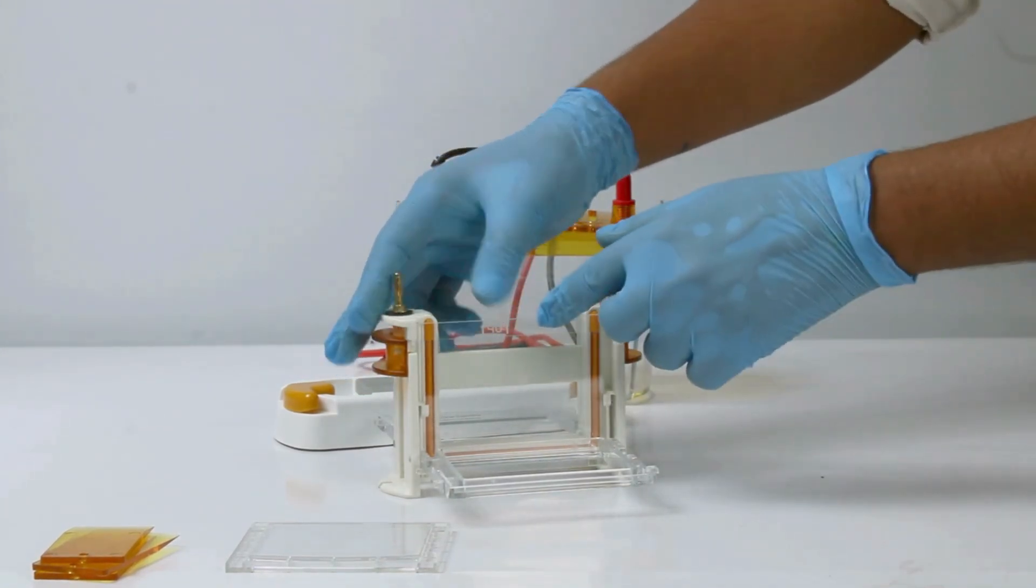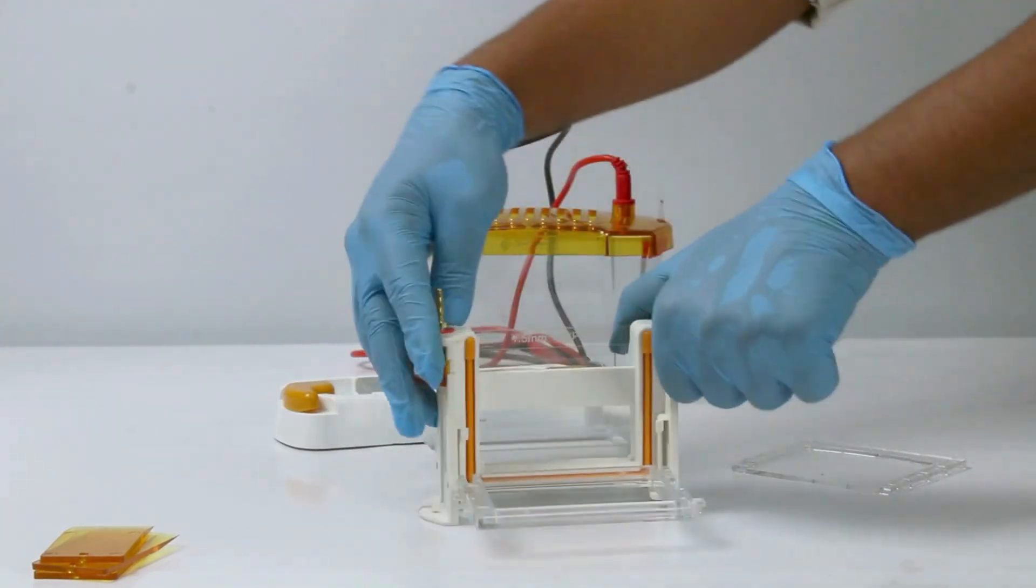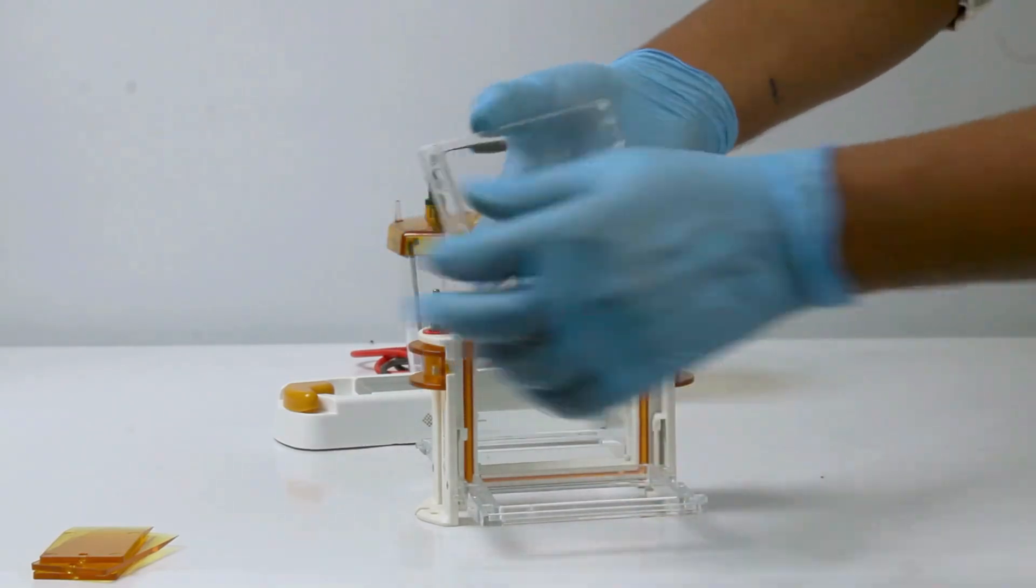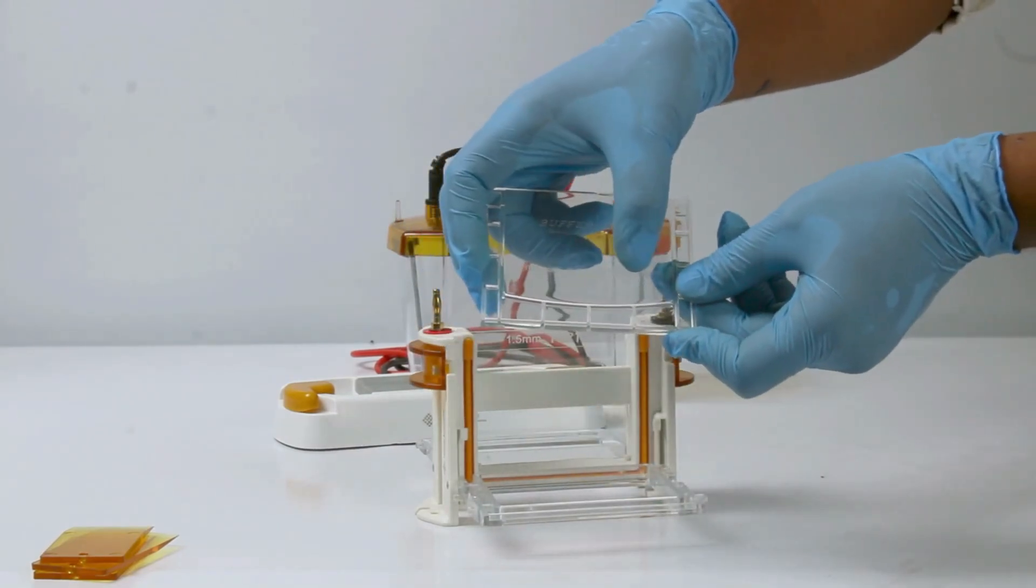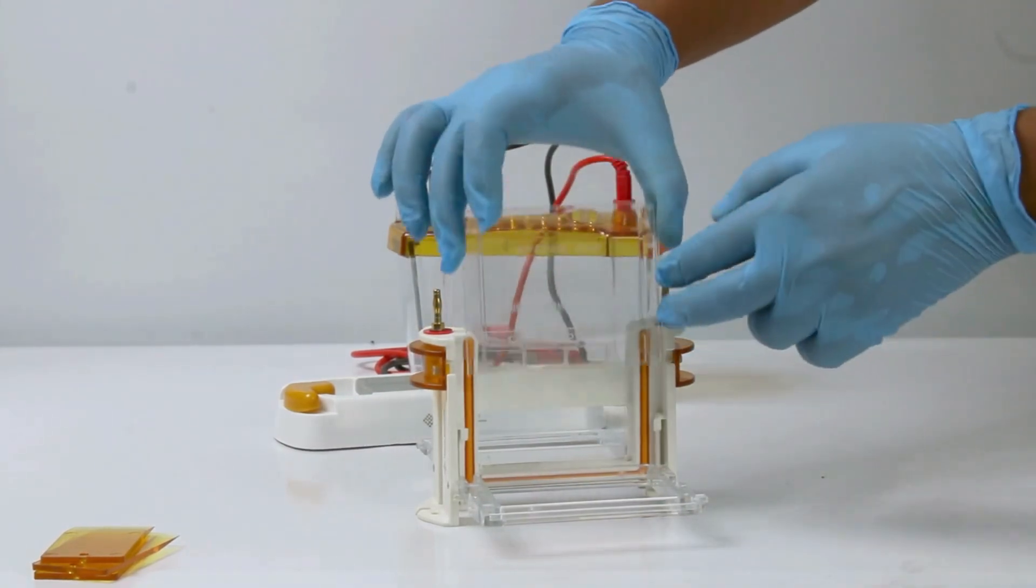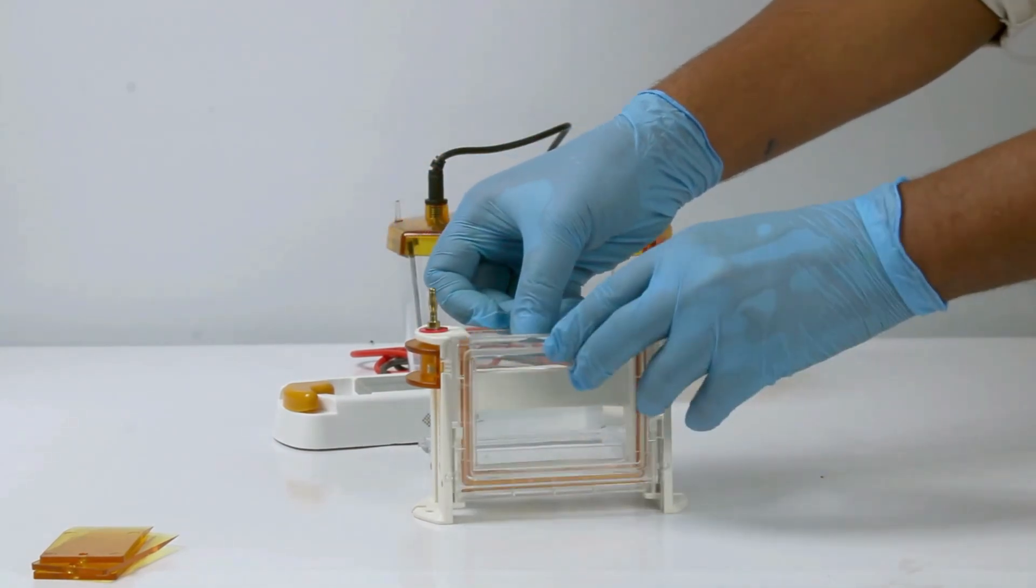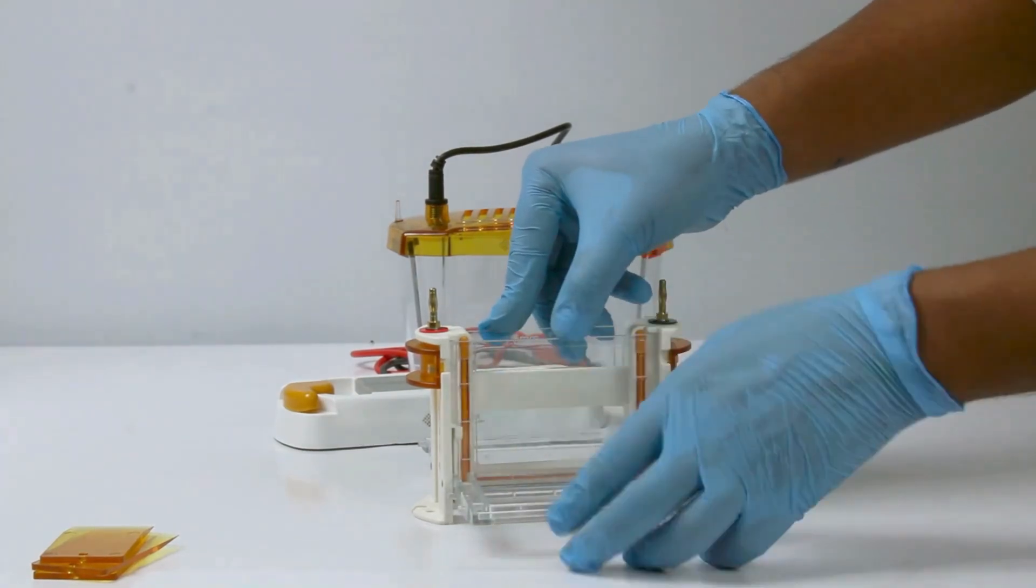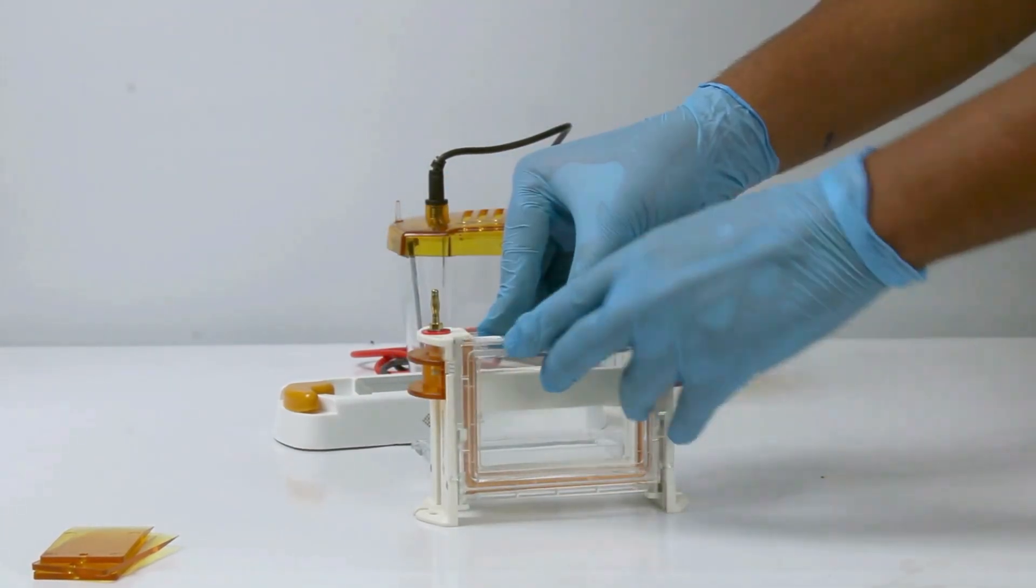If running a single gel, insert the buffer dam on the opposite side of the bracket. If running two gels, place the second one on the other side instead of buffer dam. Then close the casting unit properly.